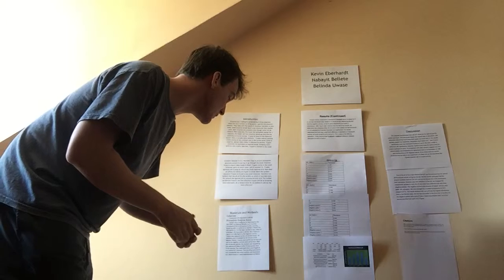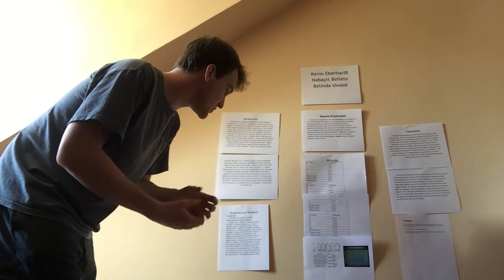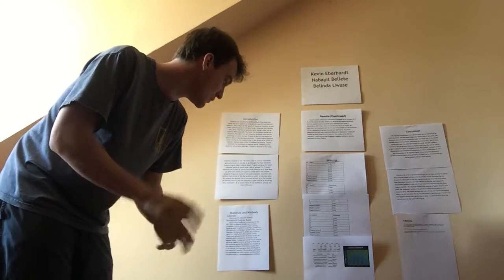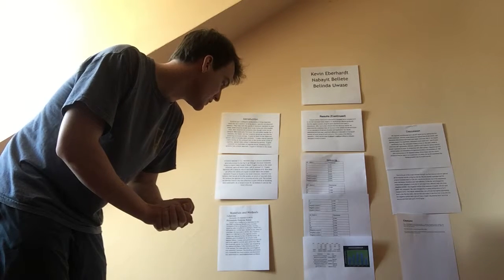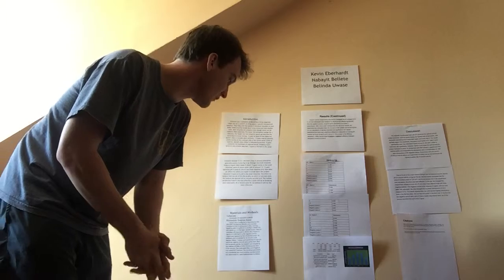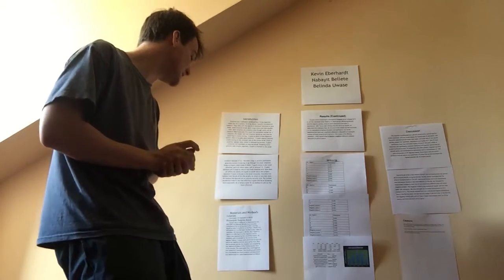And then what we did was we incubated this mixture for 20 minutes at 50 degrees Celsius. So we performed 3 assays at each pH, and then after the incubation period, we stopped the reaction by adding 500 microliters of 10% trichloroacetic acid, or TCA.